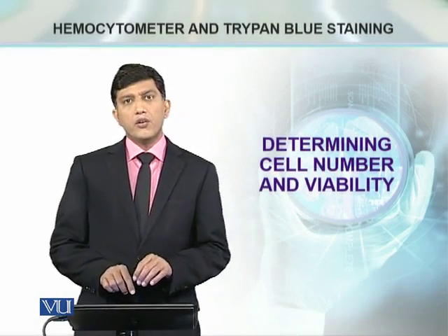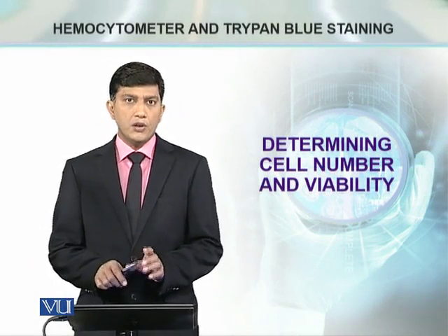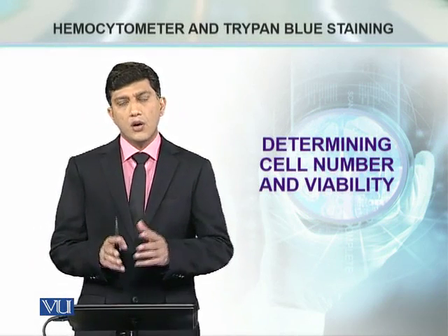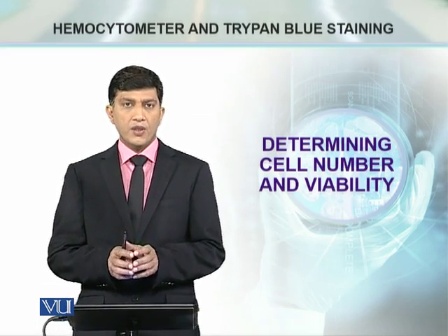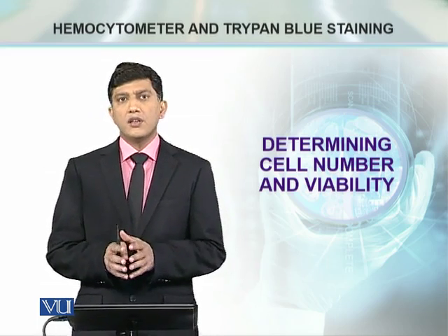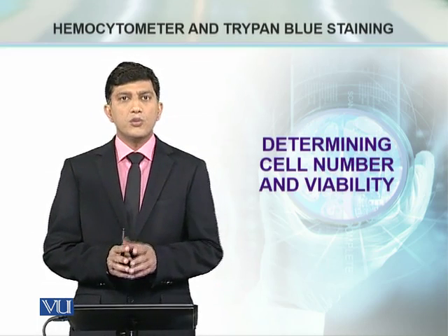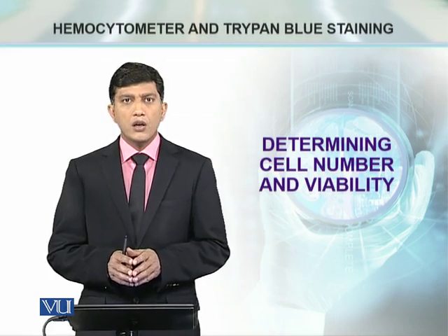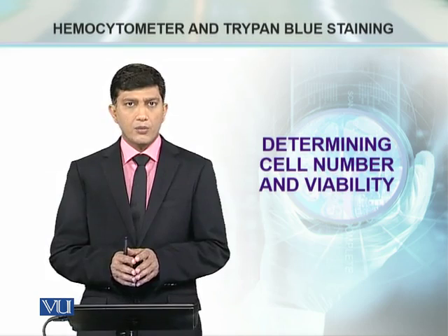सेल thawing एंड रिकवरी के बाद जो नेक्स्ट स्टेप है, टू इंश्योर द लाइफ सेल्स, द काउंट ऑफ द लाइफ सेल्स, वी नीड टू परफॉर्म सेल काउंटिंग. सेल काउंटिंग के हवाले से हम पहले भी मॉड्यूल में बात कर चुके दैट वी यूज़ हीमोसाइटोमीटर फॉर मैनुअल सेल काउंट और सम टाइम्स वी हैव द ऑटोमेटेड सेल काउंटर्स अवेलेबल.